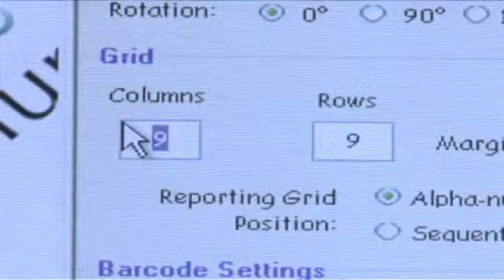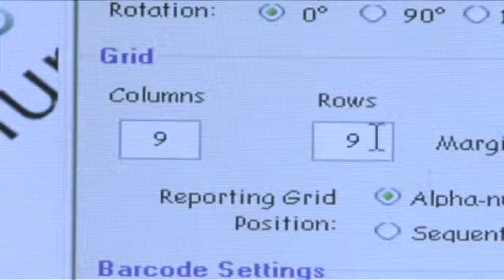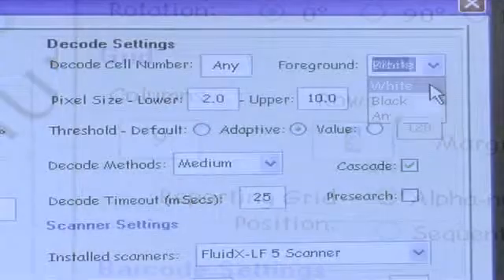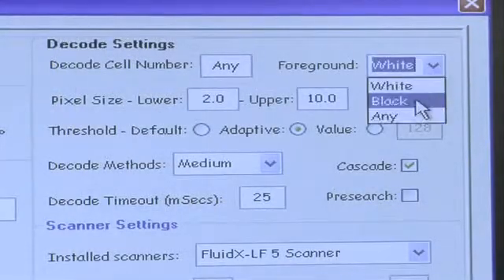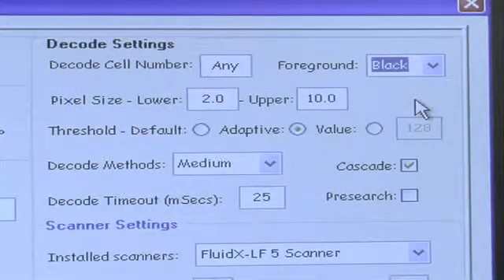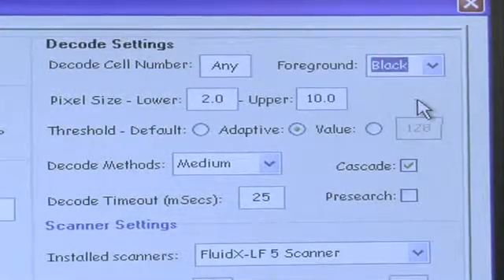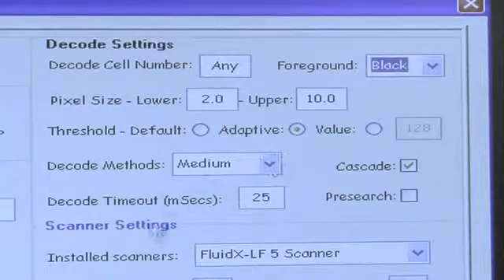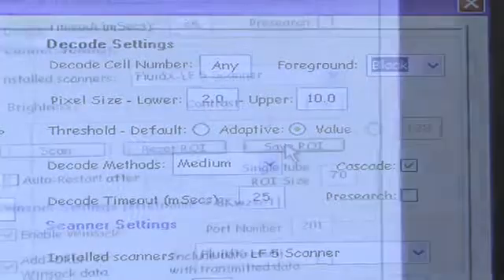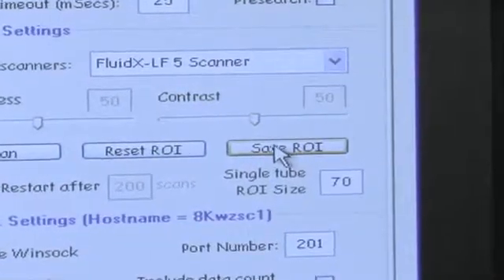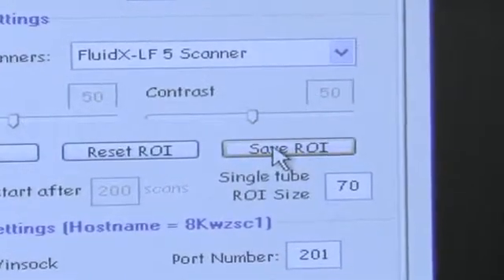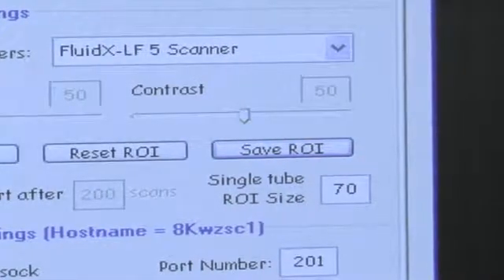Rows and columns are customizable, as well as white on black or black on white 2D data matrix barcode. On the right side of the dialog box, click the far right button labeled Save ROI.